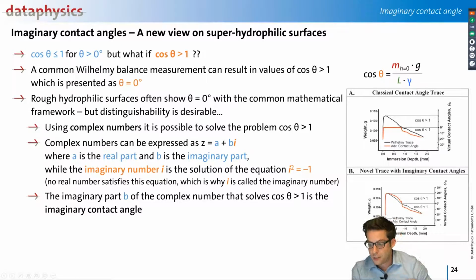So this means with this old method here, you could distinguish between contact angles from 90 degrees to 0 degrees. But all of these measurements here, it would all give you a number 0 as a result. But the coatings can be completely different. On one coating or on one treated substrate, water spreads very fast. On the other one, it spreads super, super fast. But for all of them, you get 0 as a result. It's very frustrating because you optimize it and you cannot see what has become better.